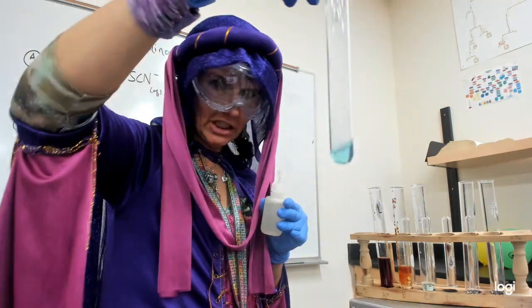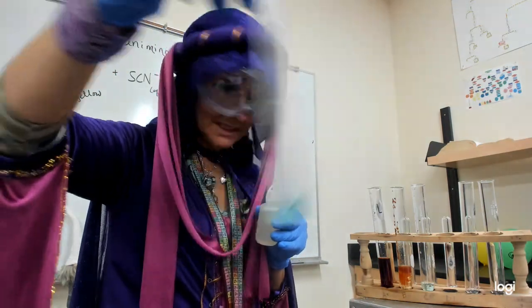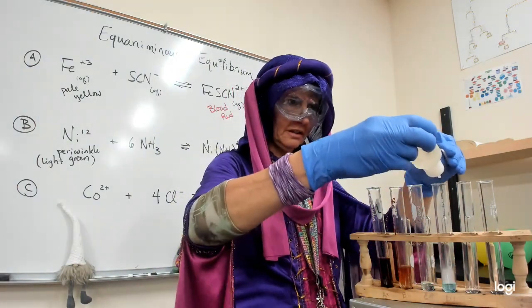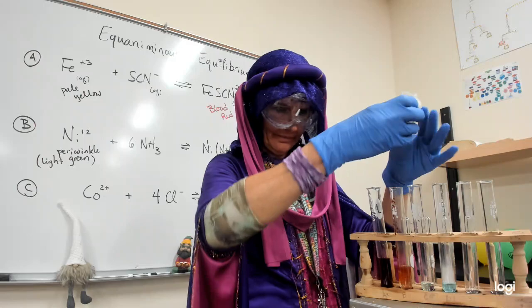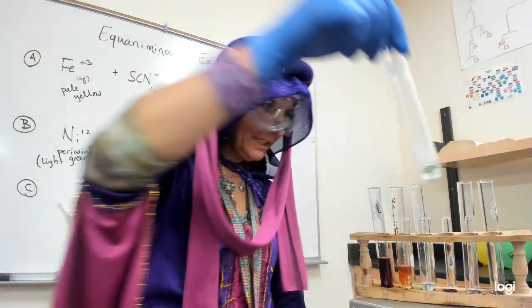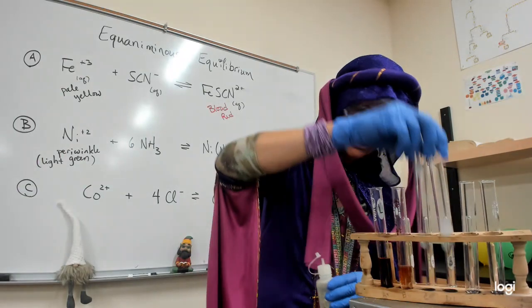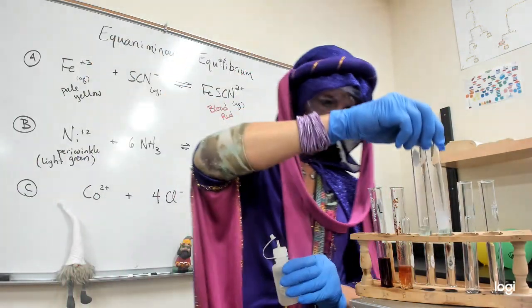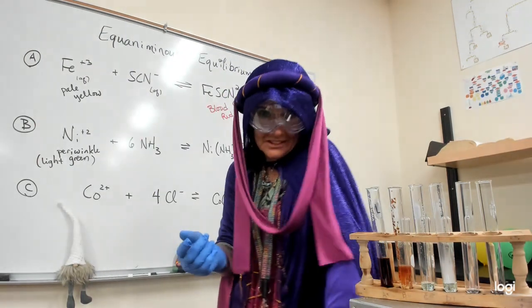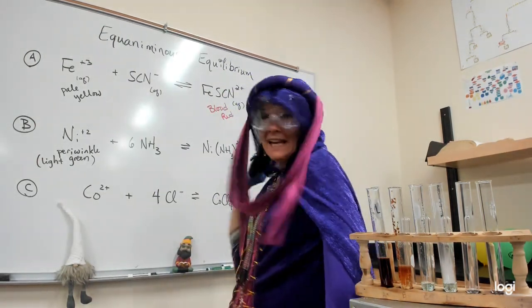It's changing. It's not as blue as it was. What happened to the blue? That's actually another lab. It's an oxidation reduction lab. But look, it went back to the green. It's back to the same color we started with. What happened? Well, that's the question. If you keep watching, give me 10 points.